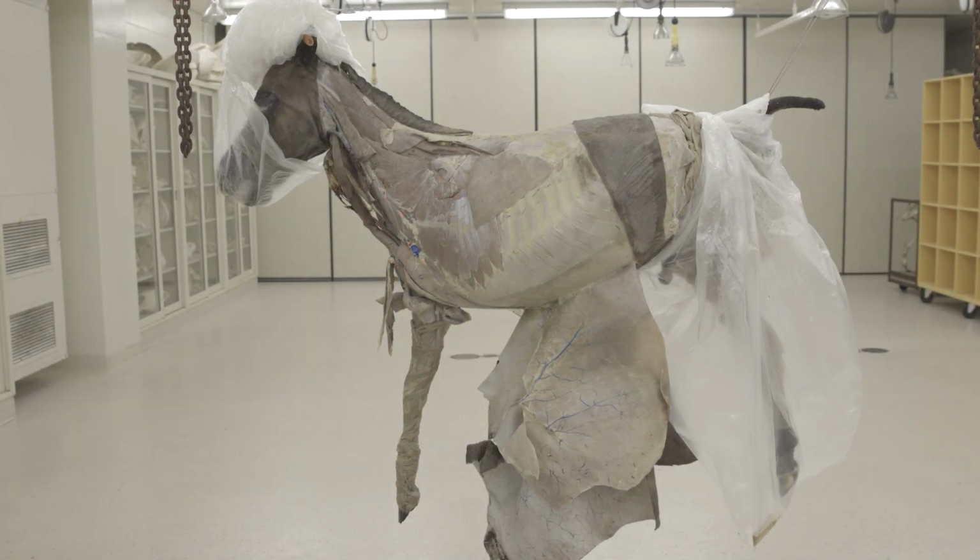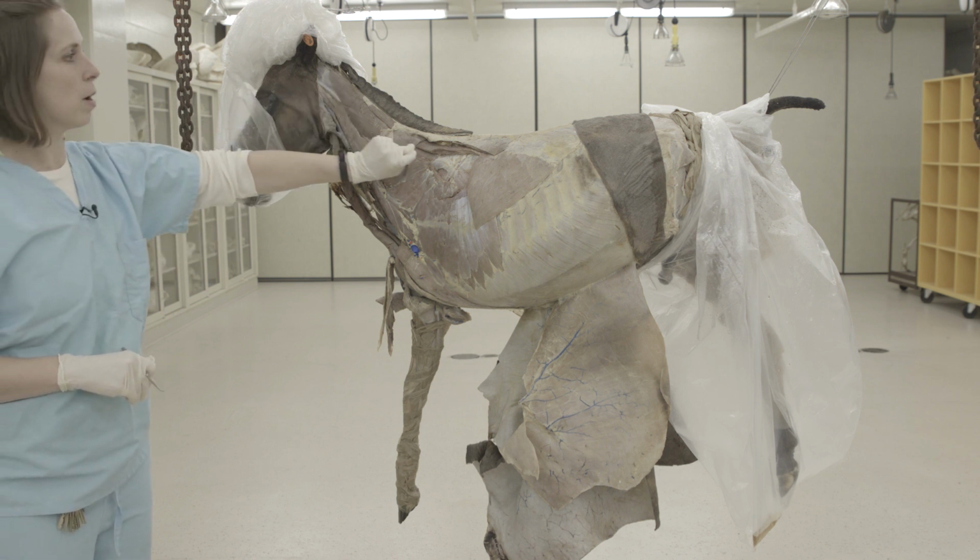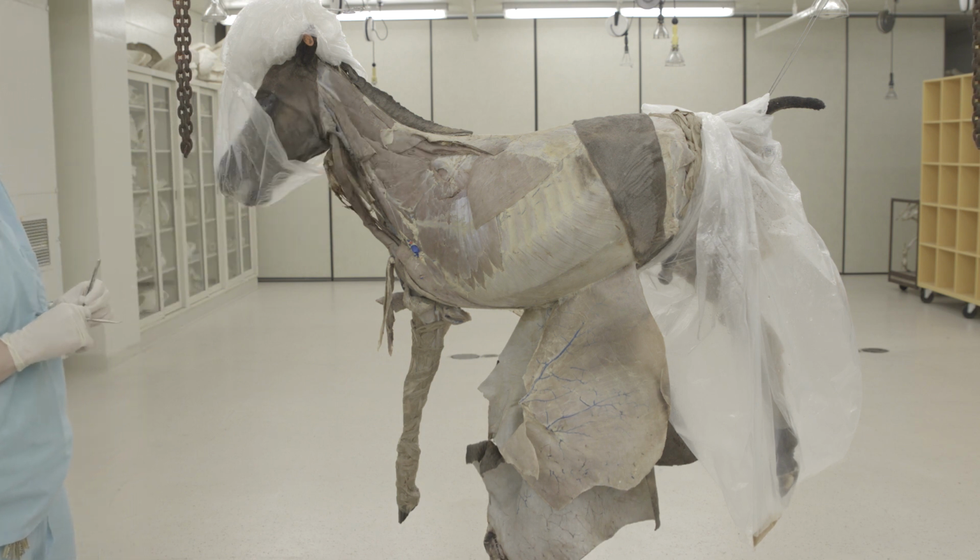For this lab, we'll be working on the neck region of the pony specimen, and you'll be dissecting both sides of the specimen, both left and right. So we'll actually start with a closer in view of the nuchal fatty crest, which will be in this region here, and then we'll reflect that to look at the nuchal ligament.